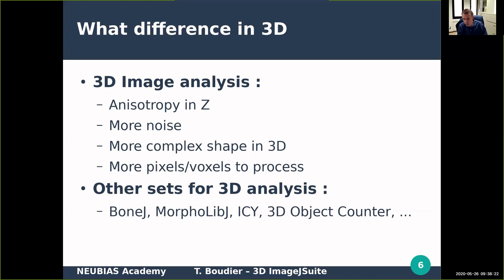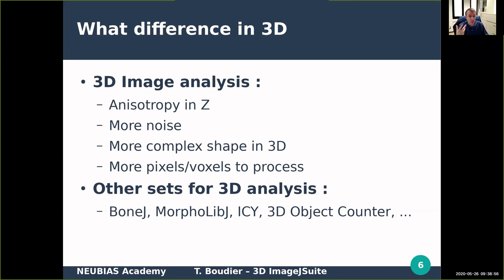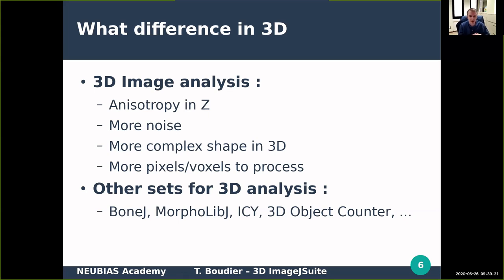Why do we have specific algorithms for 3D? The main problem is anisotropy in Z — the pixel size in X, Y, and Z is completely different. It can be three or four times larger in Z than in X, Y, so you need to take this into account during analysis and processing. Also, 3D images tend to have more noise than 2D projections, and the shape is more complicated in 3D. You also have more voxels to process, so you need robust and fast algorithms.